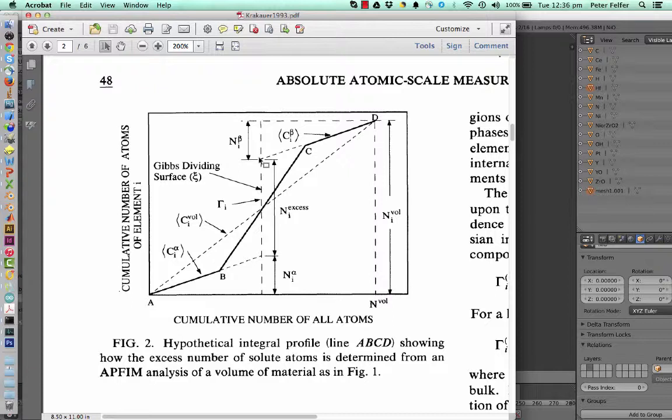And I'll give you a program that has an interactive user interface for that, so you can easily tweak and adjust so that you get the correct values and get the interfacial excess of your data. Of course, this is what the distance sorting is, so what the number of all atoms is versus distance. That's easy if you've got a one-dimensional case. We've got highly curved three-dimensional surfaces.